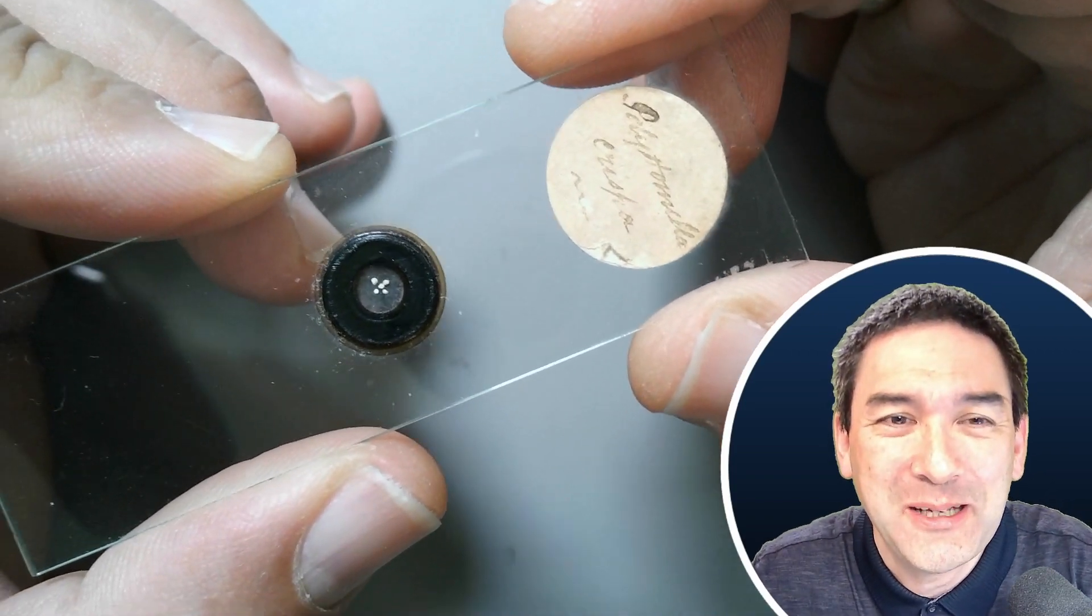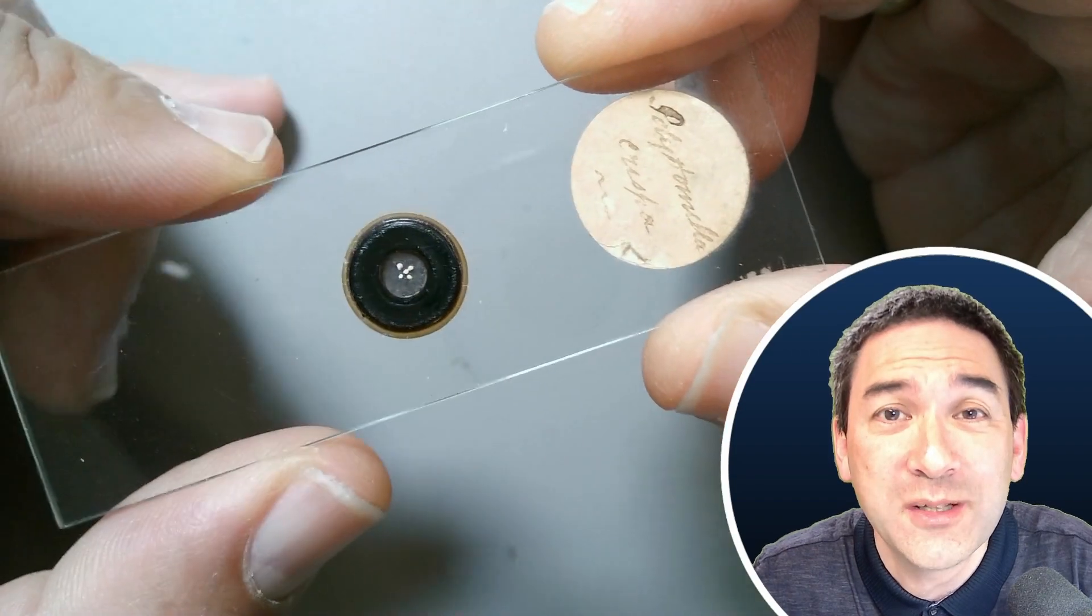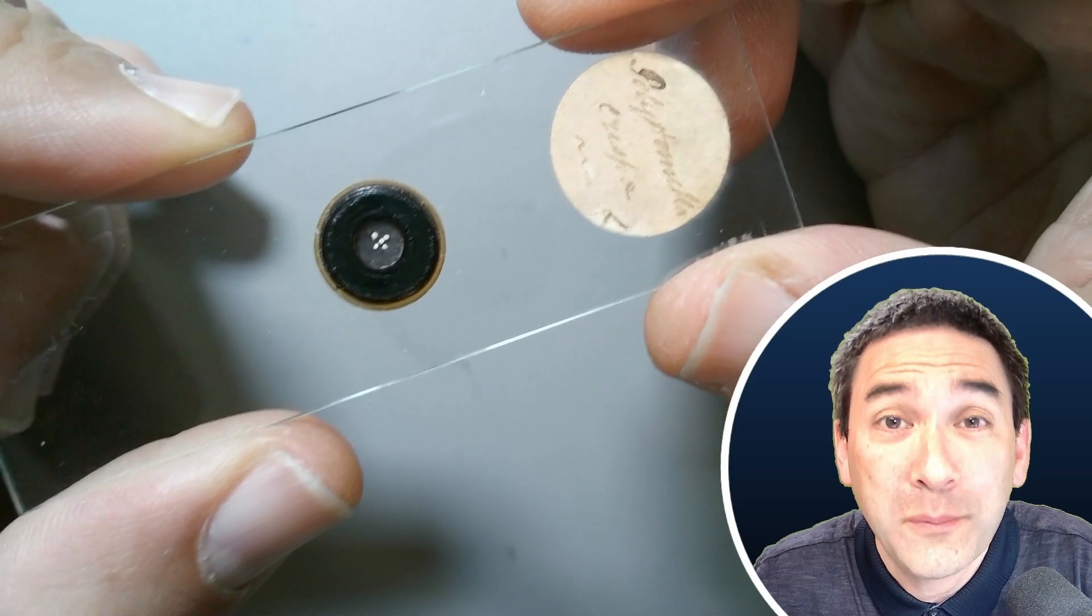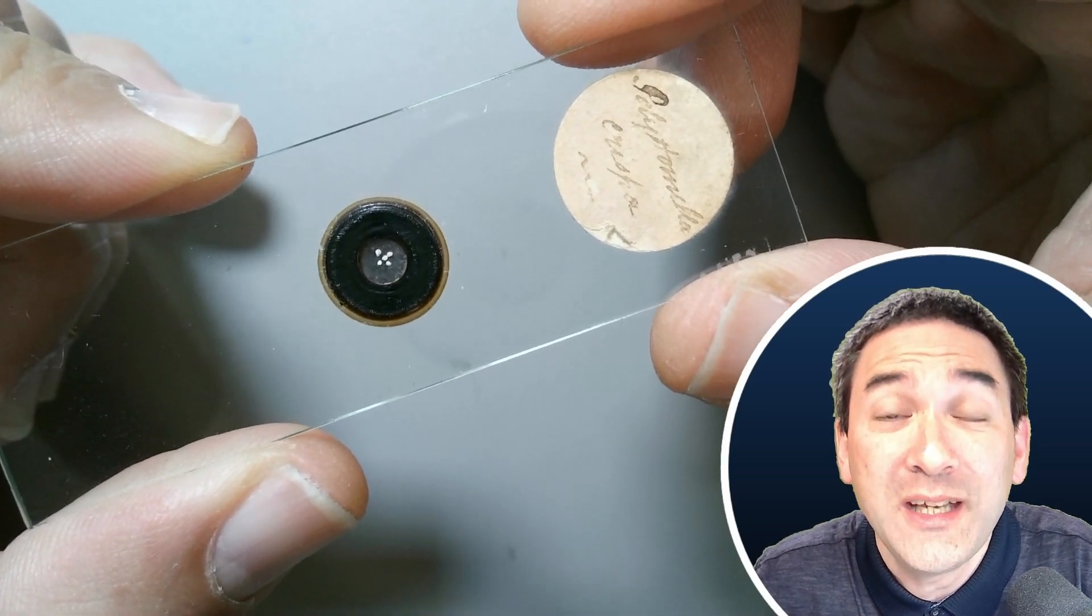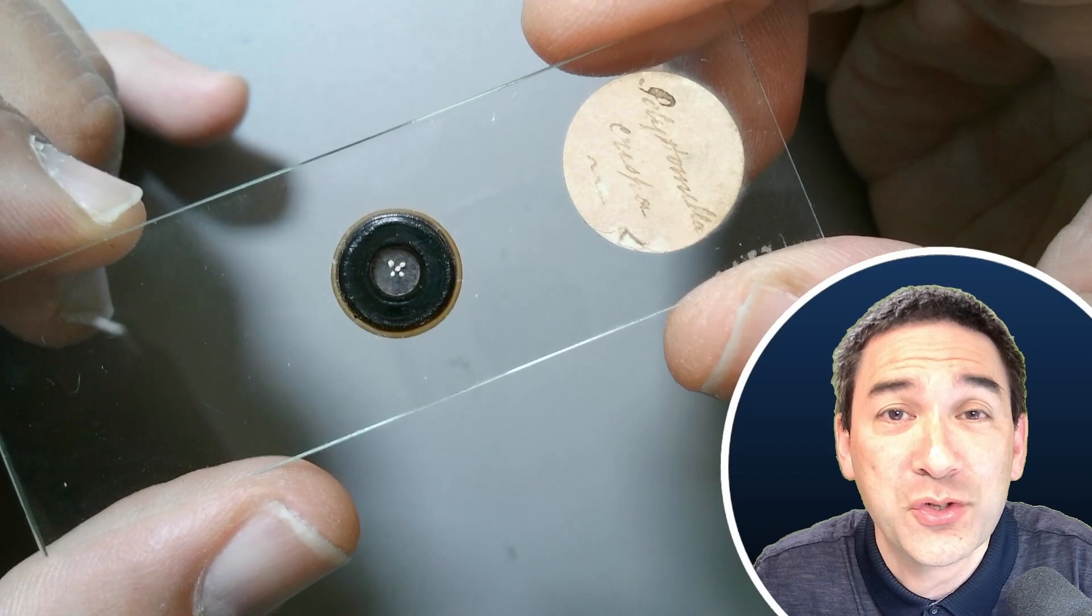I think I need to explain this a little bit. Those tiny white dots that you see here, these are the shells of single-celled protists, single-celled microorganisms called foraminifera, and they produce intricate shells. They've arranged several of those here on this microscope slide.